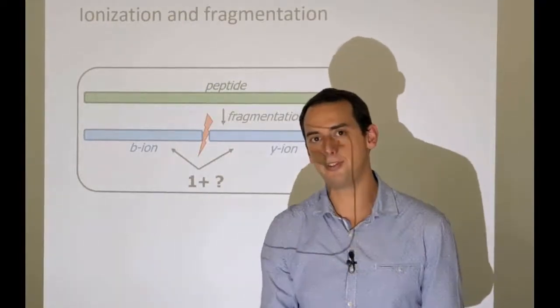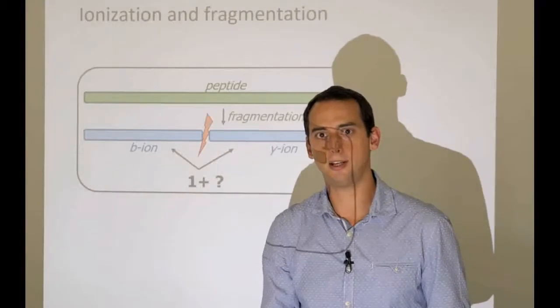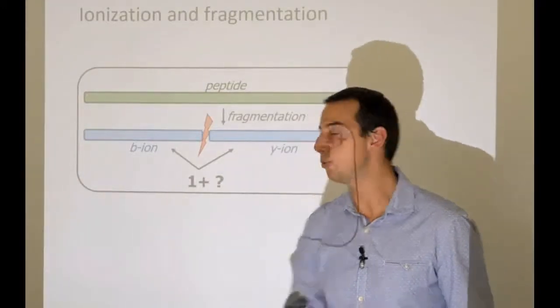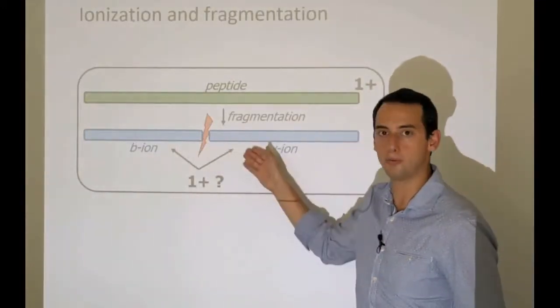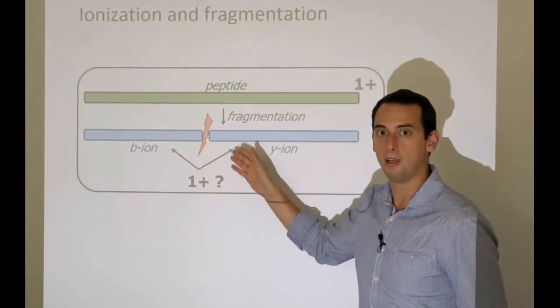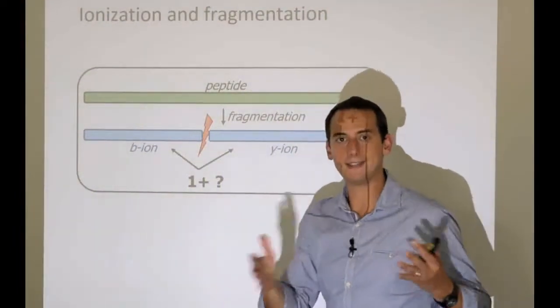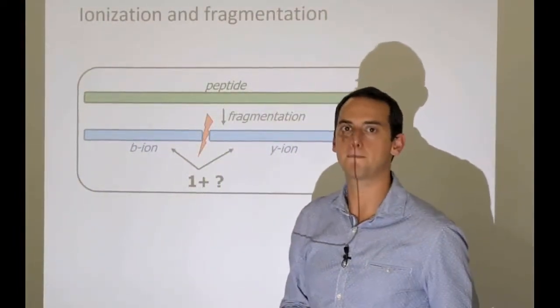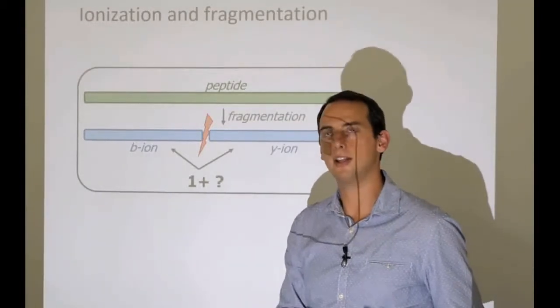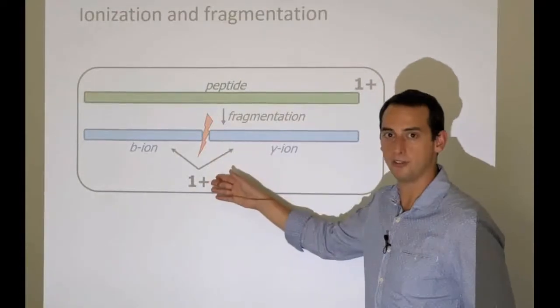So the efficiency of fragment recovery in MALDI is necessarily half, because you will definitely lose one of the two fragment ions. You will not be able to see both. This is really problematic because it creates less dense, less informative spectra. I say problematic, let's say it's annoying rather than problematic, and it's less efficient as a result.